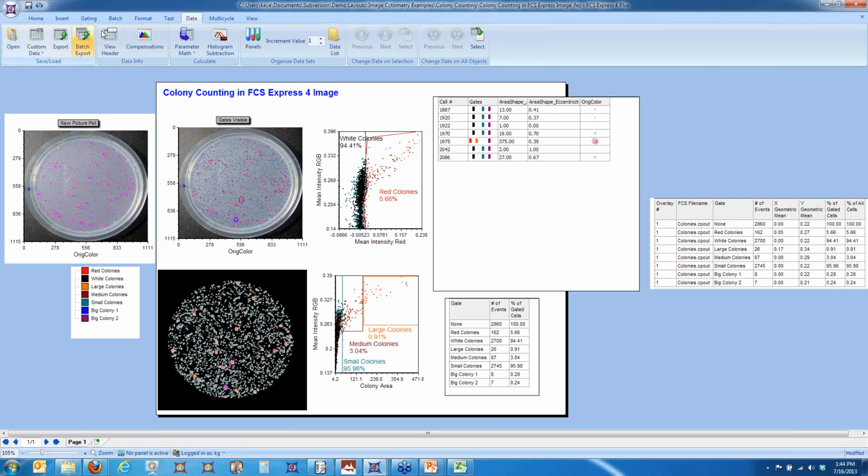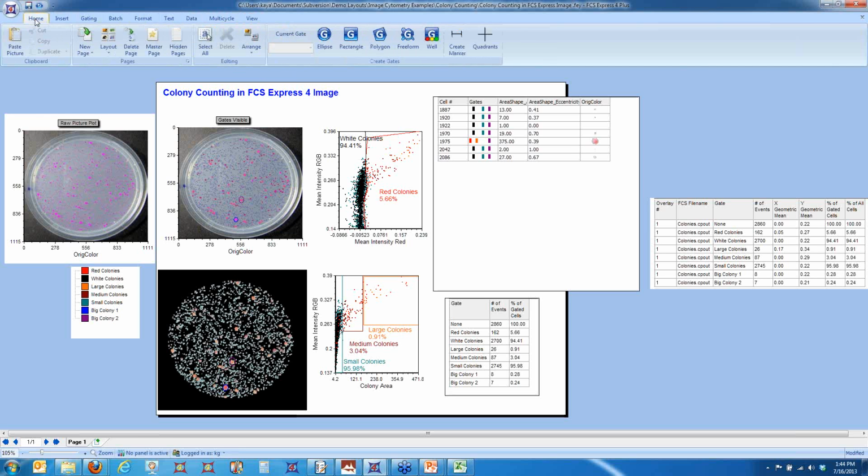We also have the ability to make bar plots. So I've already shown you in the last layout we looked at a regression analysis with a nice line plot with the regression line overlay. You can also make bar plots if you'd like to with error bars. So there's all sorts of things you can do in FCS Express, and of course we really didn't have a chance to talk about nearly all of them.